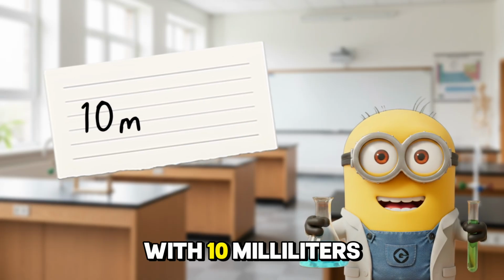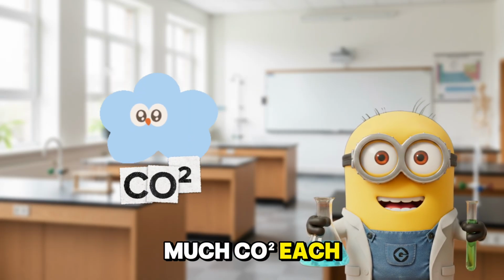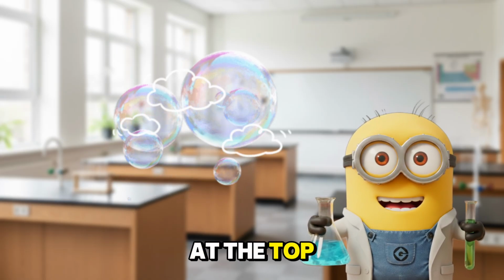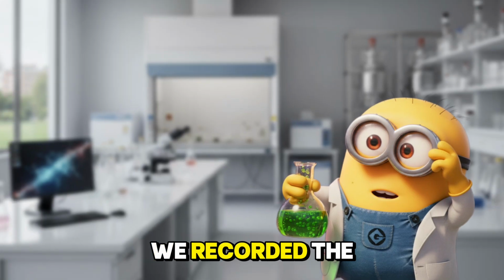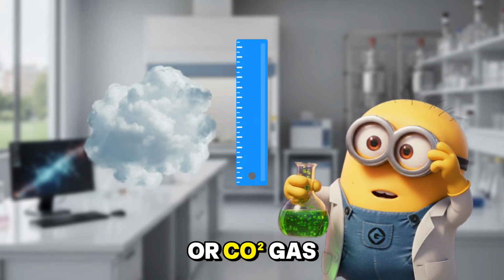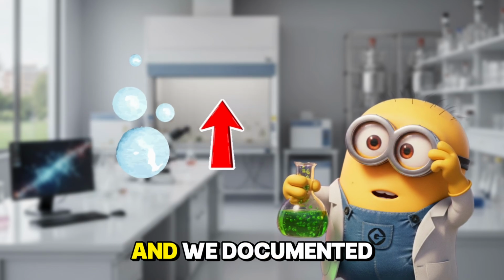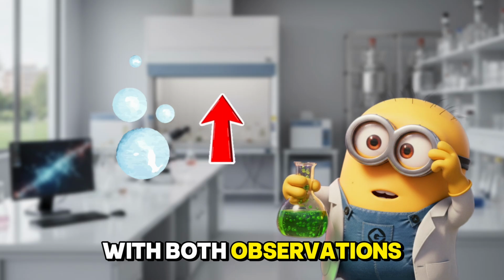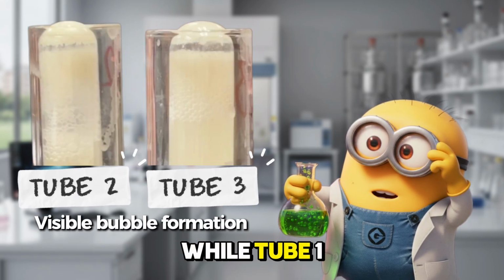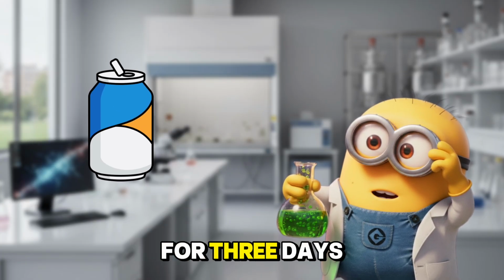All tubes started with 10 milliliters of yeast, and we observed them over time to compare how much CO2 each one produced. If fermentation occurred, we would see bubbles and foam forming at the top of the mixture. We recorded the gas production in each test tube over time, checking and measuring the height of the foam, or CO2 gas layer, at regular intervals. As the yeast fermented, the bubbles increased, and we documented the changes with both observations and measurements. Tube 2 and Tube 3 showed visible bubble formation, while Tube 1 and Tube 4 mostly stayed flat and unbubbly, like soda that's been left open for 3 days.